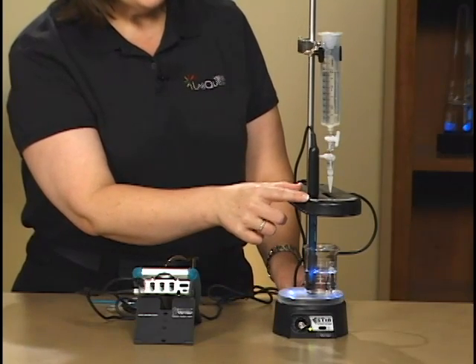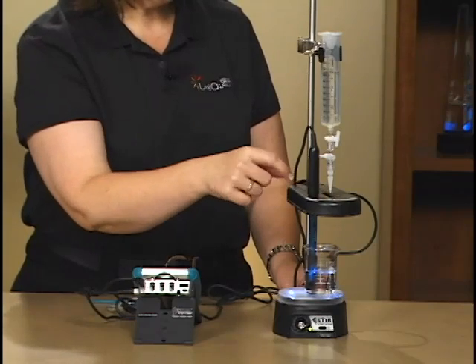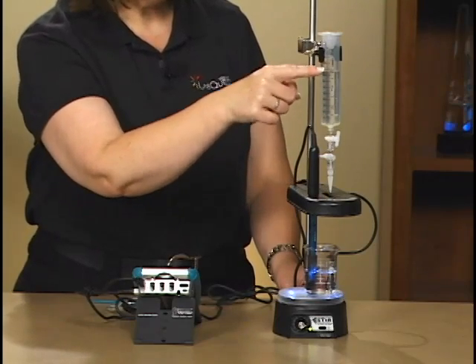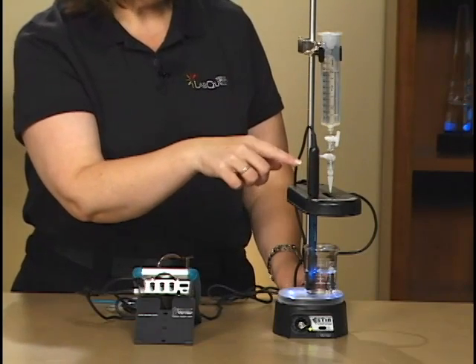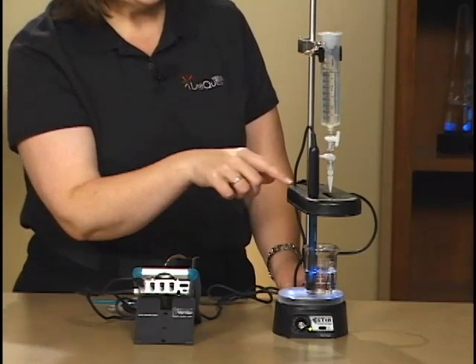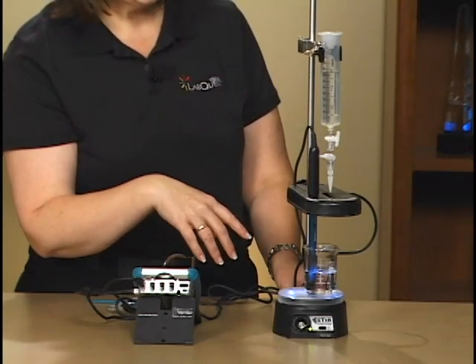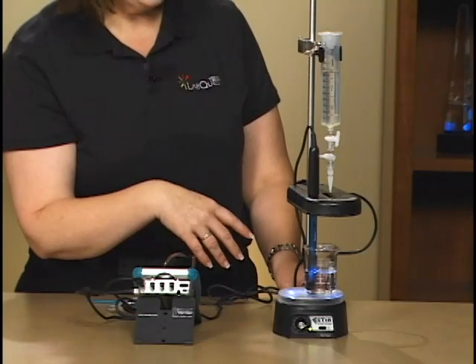The drop counter is this part here. It actually counts the drops that fall through from this reagent reservoir into the beaker and it counts them by breaking a little infrared beam and counting the number of drops. The software then converts that into a volume in milliliters.